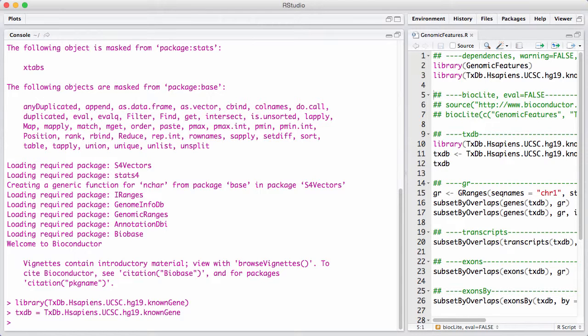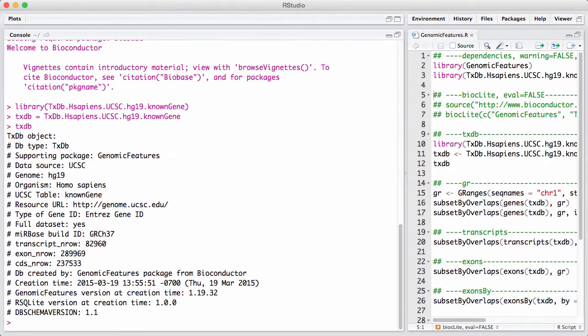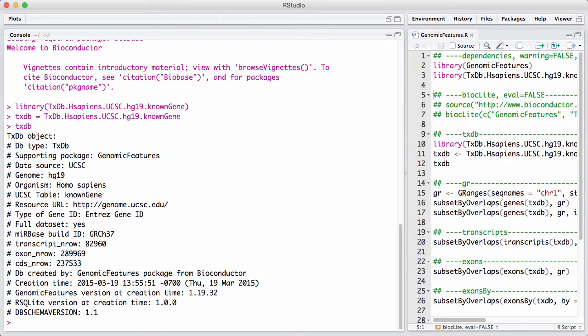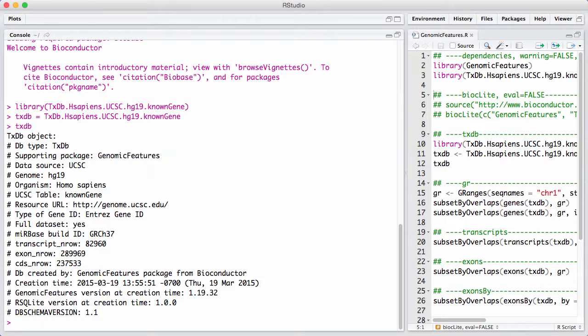So what is a txdb object? Let's try to print it. Basically, it contains information about genes, transcripts, exons, and coding sequences. This is a complicated structure. In human, we know that exons can be part of multiple different transcripts. Different transcripts can have different coding sequences. And one gene can often have many different transcripts.